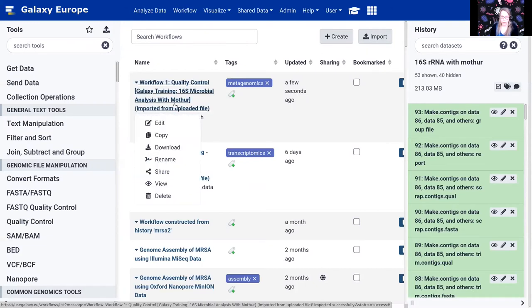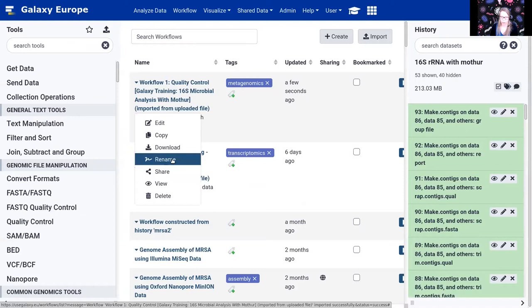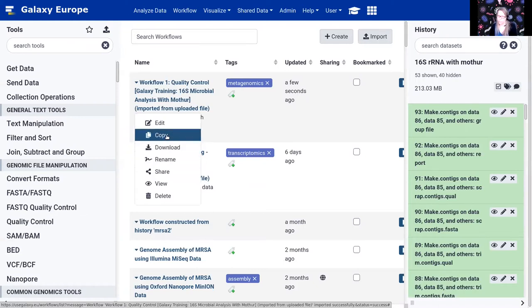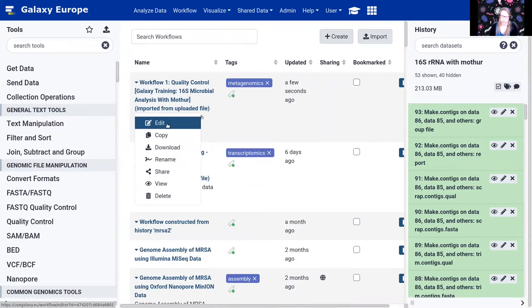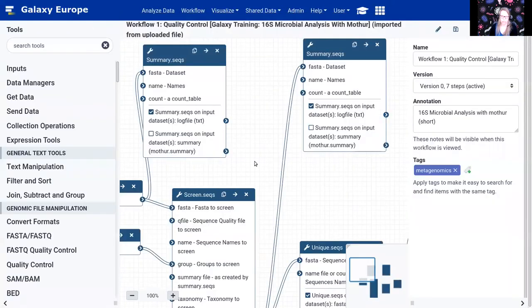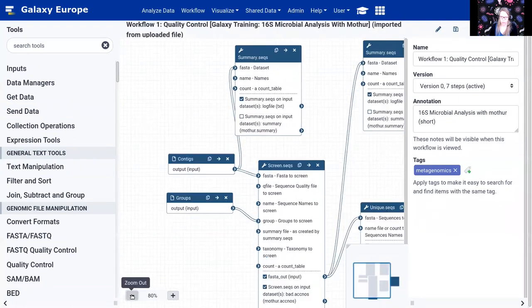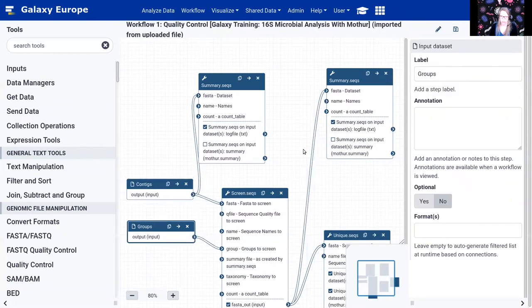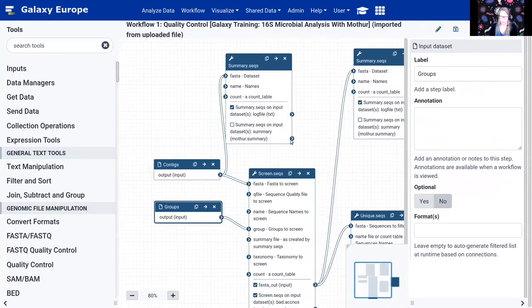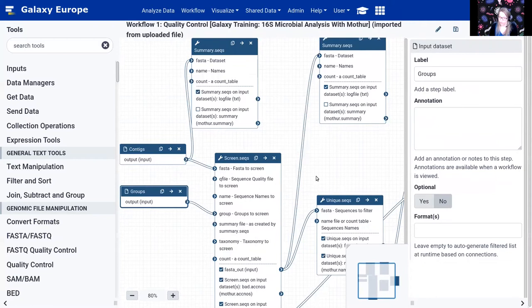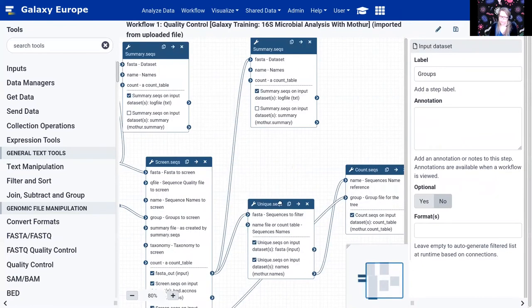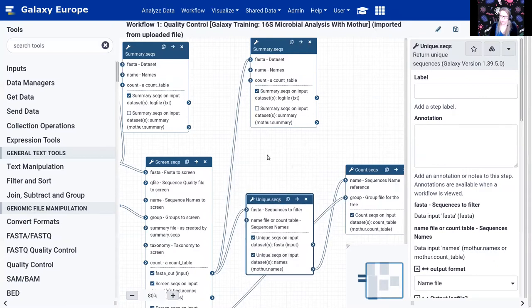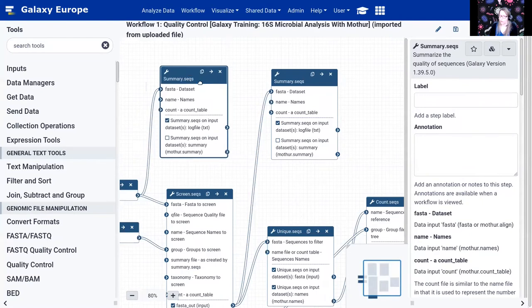If you click on the workflow name you can view all the steps, rename it, make your own copy, or hit Edit to see exactly what it does step by step. It takes the contigs FASTA file and group file, runs screen.seqs for filtering and trimming, unique.seqs for deduplication, and summary.seqs which gives summary information about our dataset without modifying it.